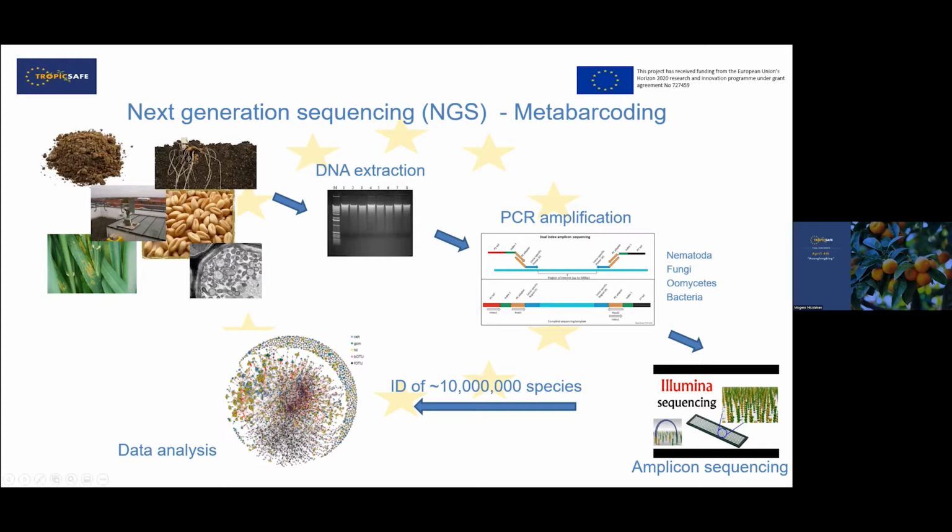Also included in the primers, we have what we call tag sequences, which means that we can distinguish the PCR products after the PCR, so we can actually pool up to 500 samples in one sequencing round, which means that the technology actually becomes quite cheap.